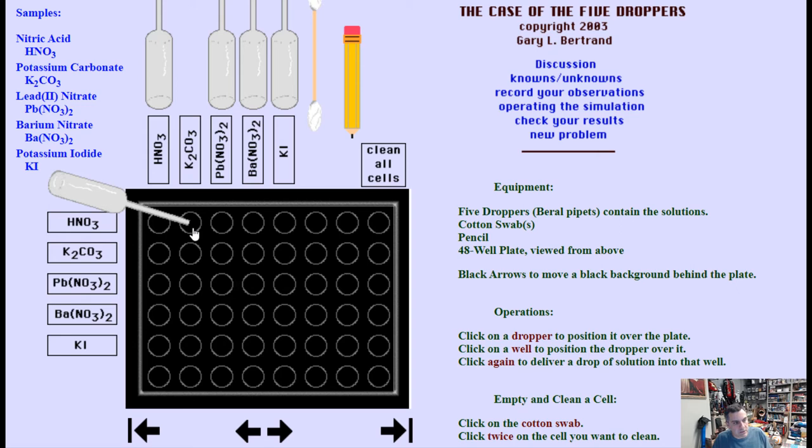If you look, wherever you come down here you can put that pipette in any of these little cells. I'm going to line it up and put it right here next to the column. So I've got potassium carbonate, I'm going to click here. And then you have to do this, really important: you first position your pipette with one click, and then you're going to click one more time and put a drop. Check that out, each click will put a different drop.